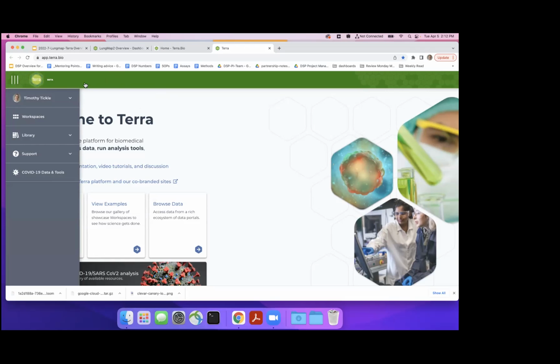So firstly, under the hamburger, we call this the hamburger. You can see here that it knows me. I've logged in, and at that point, it's going to be giving me all the authorizations and authentications that I currently have. So all the workspaces I should see, I'll be able to see. And under this, it allows me to have a profile, allows me to have groups that I will set up that I can share with, allows for billing to happen.